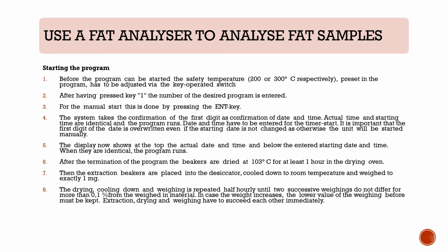Date and time have to be entered for the timed start. It is important that the first digit of the date is overwritten even if the starting date is not changed, as otherwise the unit will be started manually. Okay, the display now shows at the top the actual date and time, and below the entered starting date and time. When they are identical, the program runs.